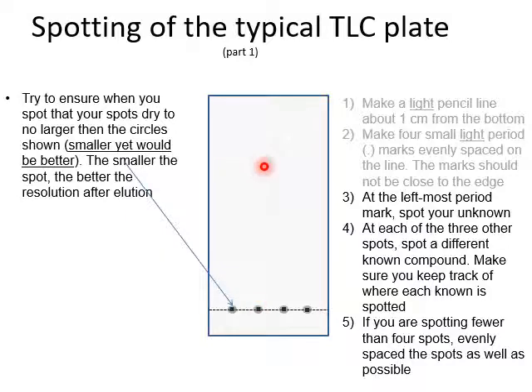And let's say this one ends up here, and then this one ends up in the middle, and then this one ends up very closely. So this is very polar, this is medium polar, and this is not as polar. So whichever spot your unknown generates, very high, medium, or low, it'll give you evidence for which analgesic you have, which one we gave you, right?